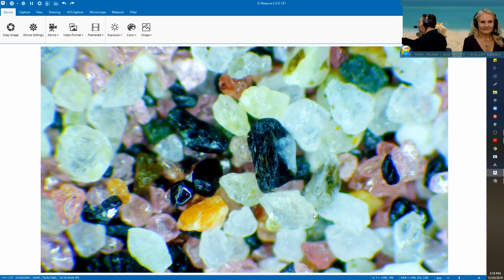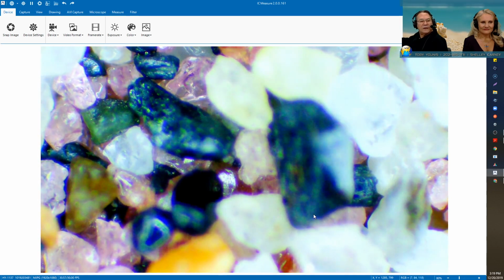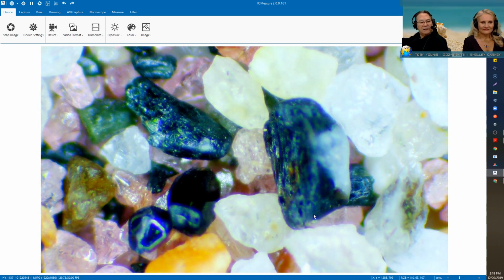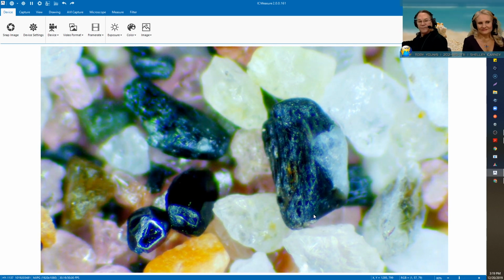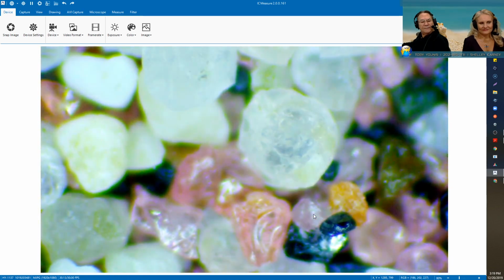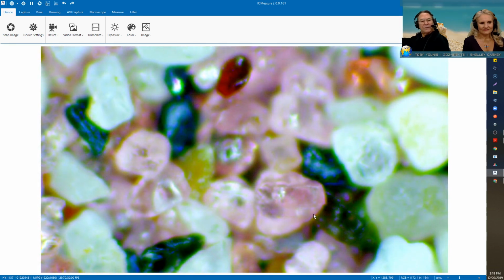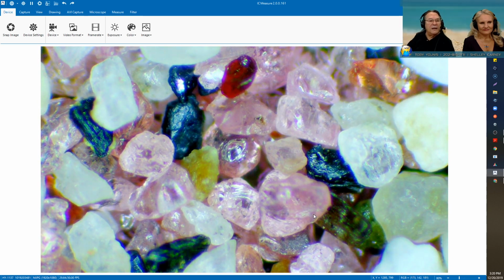So let's zoom in one more level. Let's go to 4.5x, almost 5, and give us a nice good look at that one right there. And you can see the dark ones are shiny, which to me implies that they're obsidian. I did see a little bit of, not magnetite, but galena, a little shiny galena in there. There's a mixture of the pink crystals with, up above it, you can see the orange and the bright red. I can't tell if they're garnets, only because there's so much color in all of this.